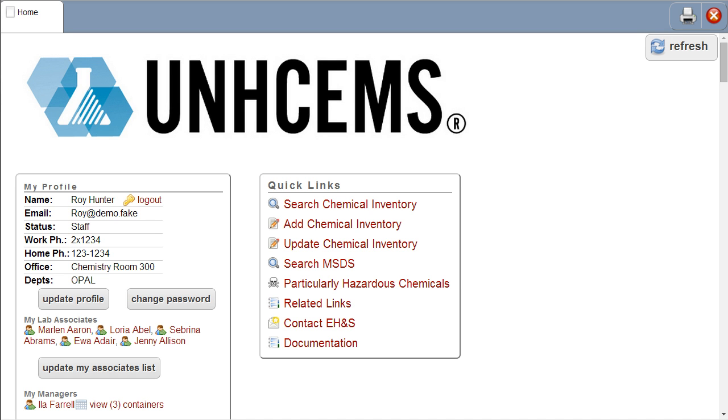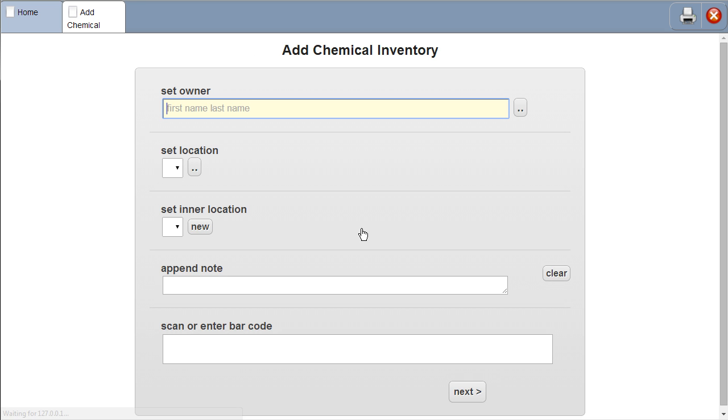In this video, I will show you how to add new chemical inventory. The ability to add new chemical inventory is restricted to only users that have the Update Inventory privilege. If you have this privilege, you should see a quick link labeled Add Chemical Inventory. After clicking this link, UNHCEMS will open a new form.